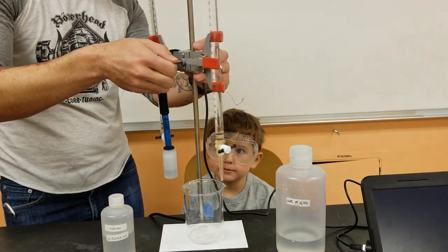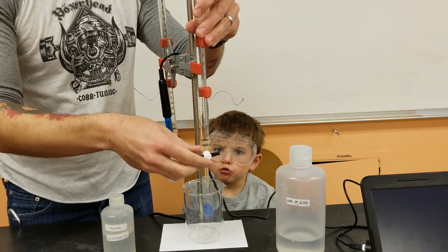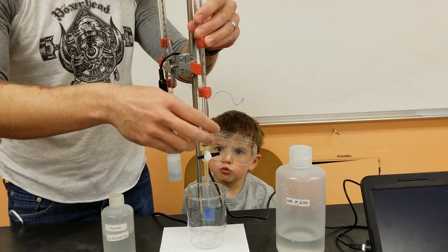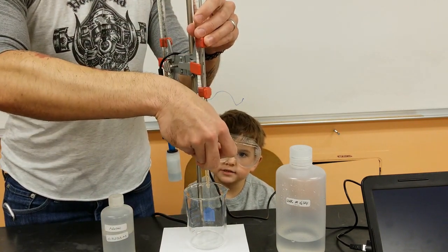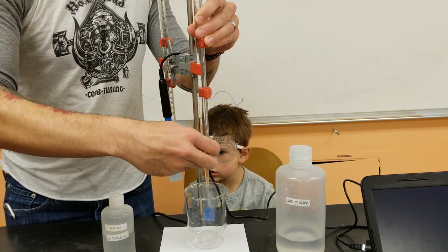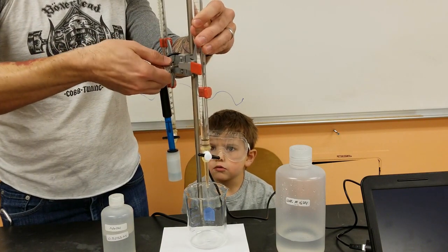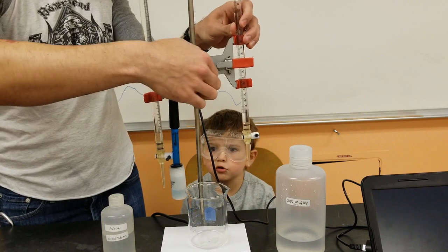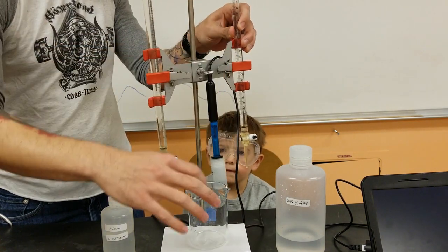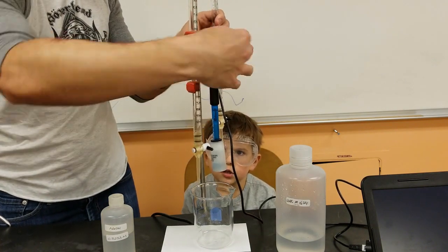What is a waste beaker? This is a beaker, and this just means that it's where I'm going to put the stuff I'm just going to pour out. Waste beaker? Yep. Means just pour out? Yep. You just want to pour a little bit. Because I was just getting it to the first line. Oh. What is that blue? That's a pH probe.